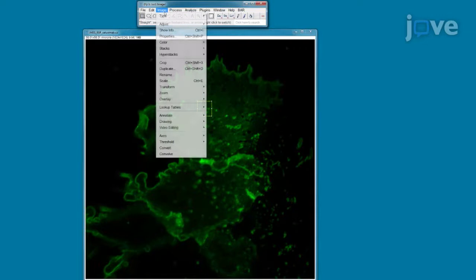Then, go to the image menu and select Duplicate. Next, go to Analyze and down to Measurement.